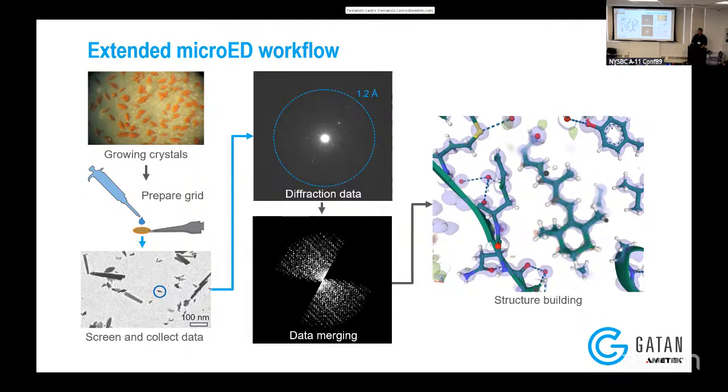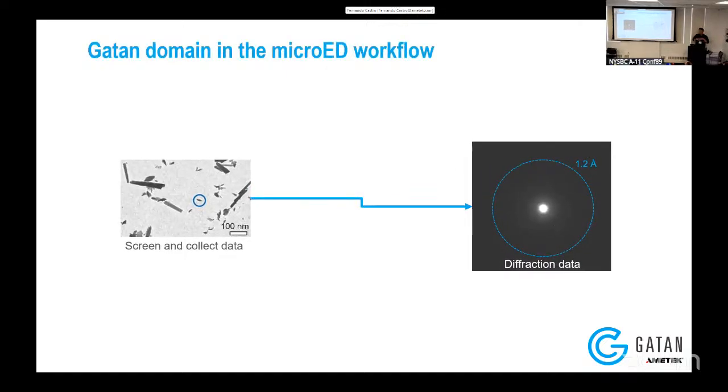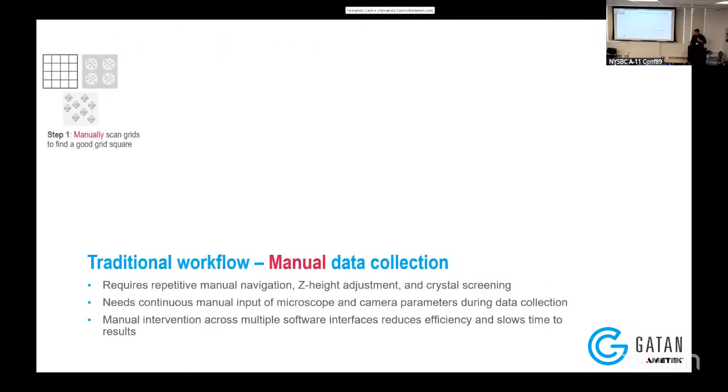have or will soon. And sometimes people ask, where is Gatan supporting the workflow for doing MicroED data acquisition from start to finish? And really, Gatan, as is the topic of this discussion, helps with the screening, the data collection from the microscope control point of view, and then also from the data acquisition point of view. So if you have questions about how you do the reconstruction and everything, I suggest you speak to one of the many other great speakers that have already presented today, and not myself.